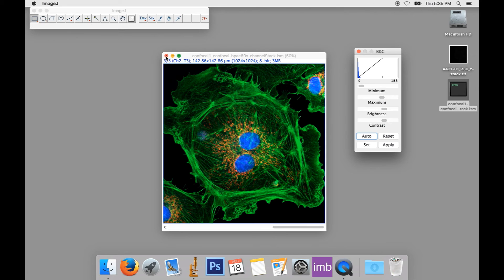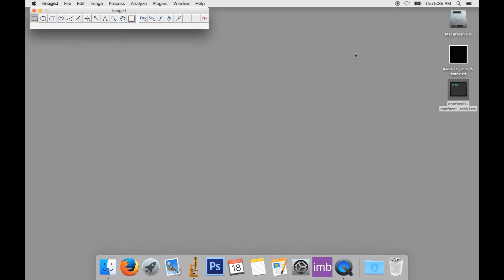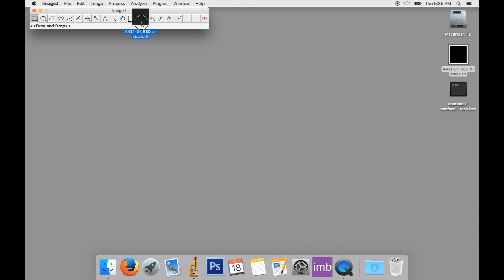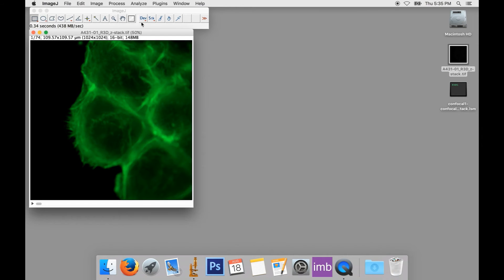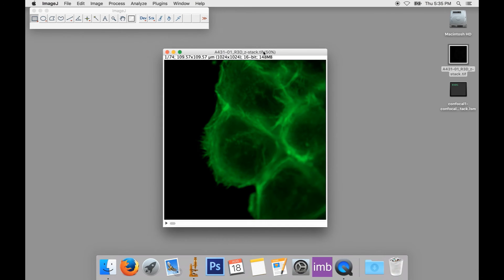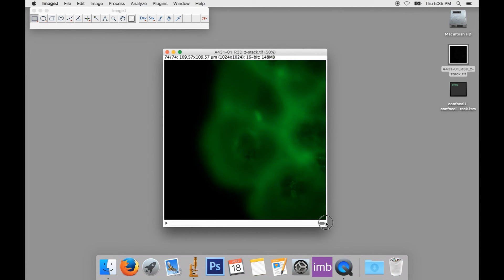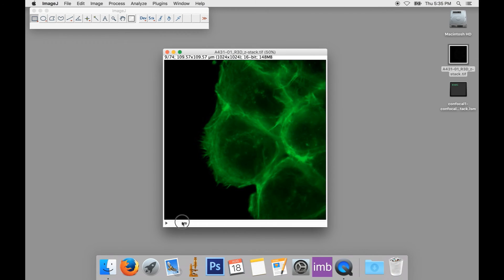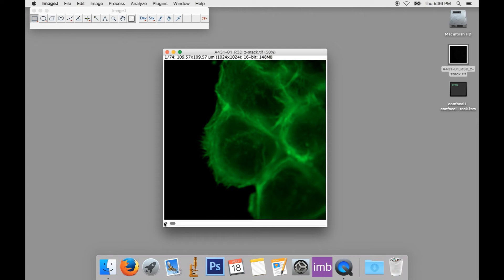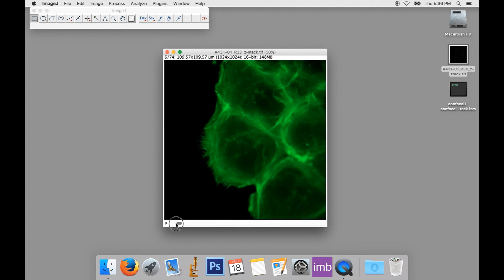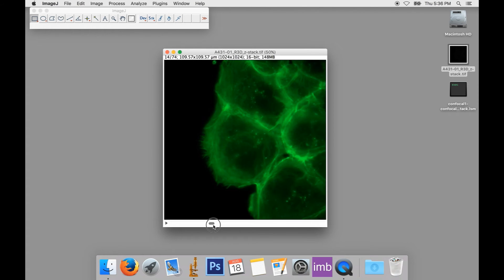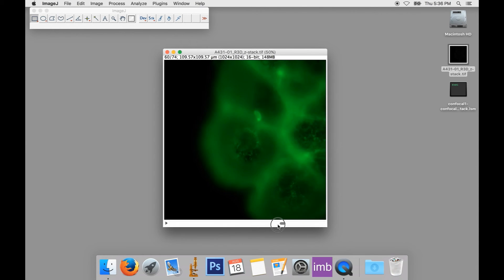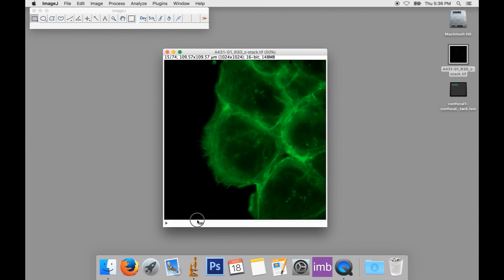Now, another kind of stack you may encounter is a Z stack. Here, we've got a Z stack that was acquired on a personal DeltaVision deconvolution microscope. The subjects are cultured mammalian cells stained with Alexafluor 488 phalloidin to label the actin cytoskeleton. Again, at the bottom of the image is a slider, this time it's not labeled. And we can use this to virtually focus up and down through the specimen and select the plane of focus in which we are most interested.